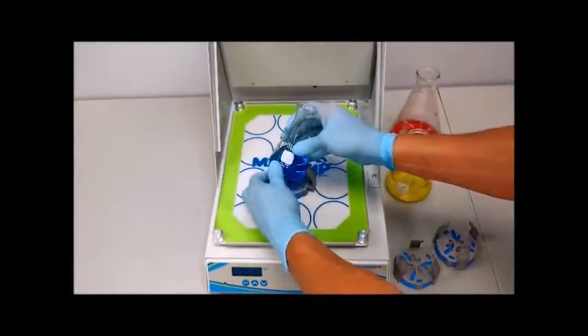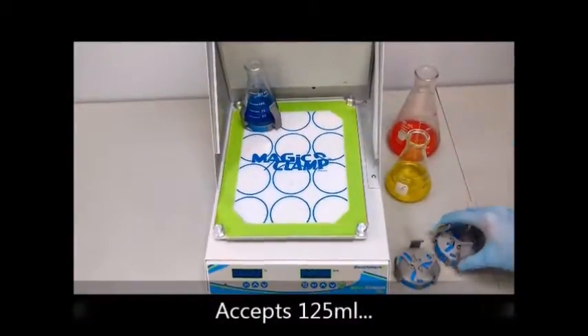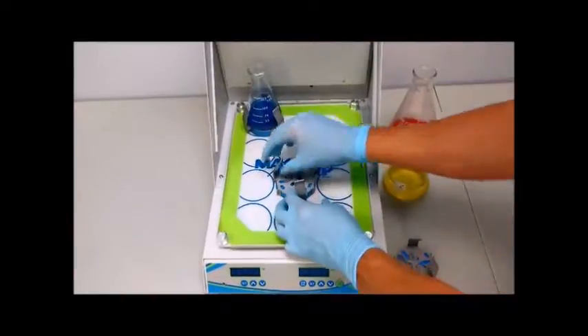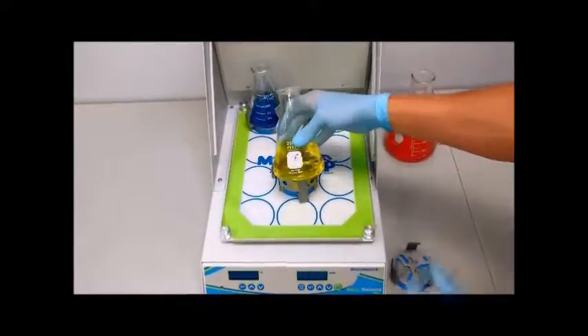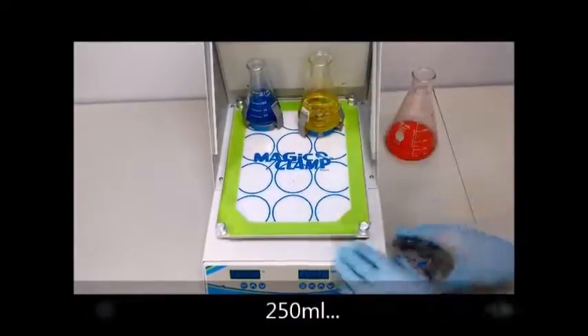In addition to our traditional clamps that are dedicated to a specific size of Erlenmeyer flask, Benchmark also offers the only adjustable clamp capable of securing 125ml, 250ml, and 500ml Erlenmeyer flasks.